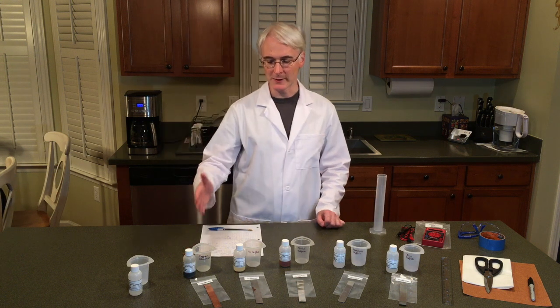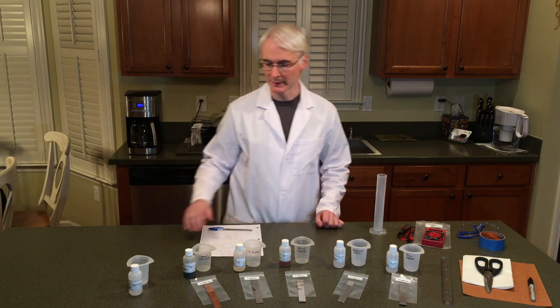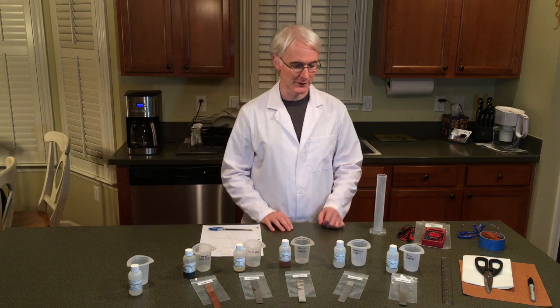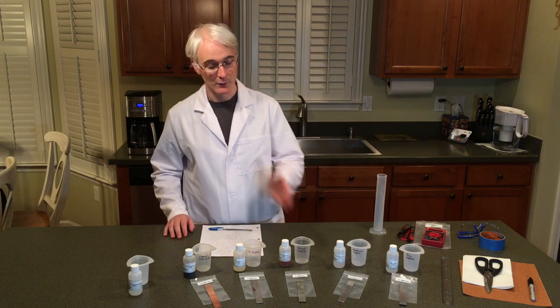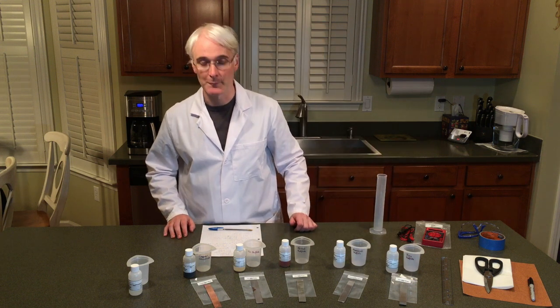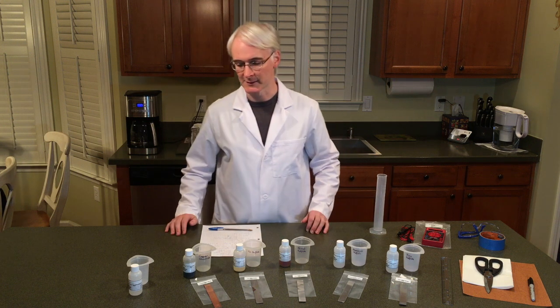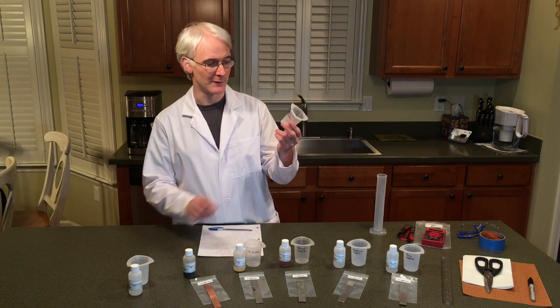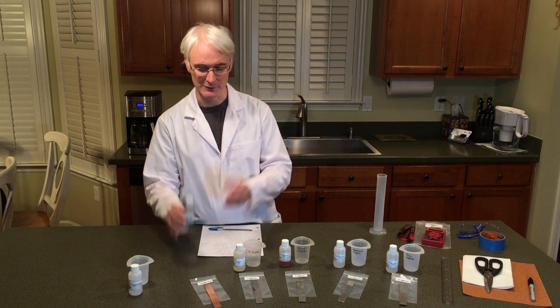Here we have five beakers, each labeled with the name of a corresponding solution. We have copper gluconate, tin sulfate, ferrous sulfate, aluminum sulfate, and zinc sulfate. We also have the five corresponding metals. Set them up so that you have easy access to each of them, and make sure you label each of the five beakers with the corresponding metal solution.